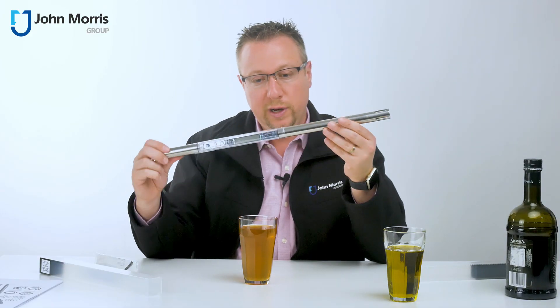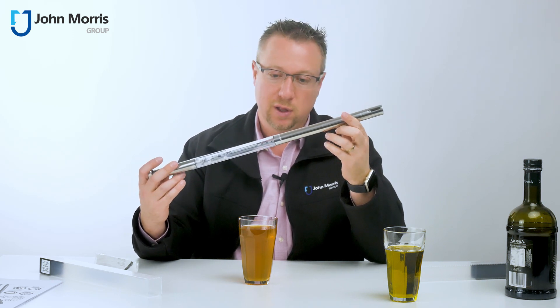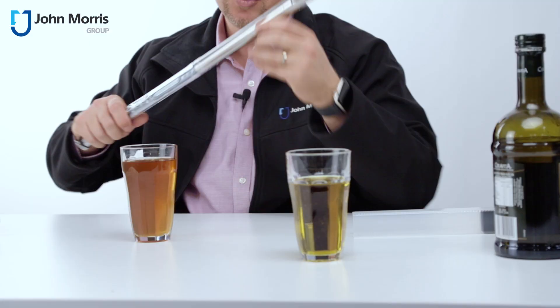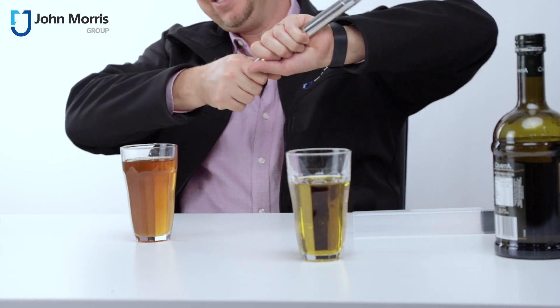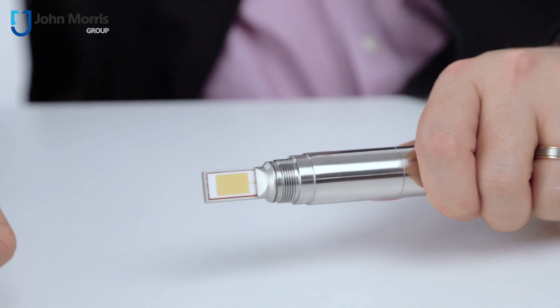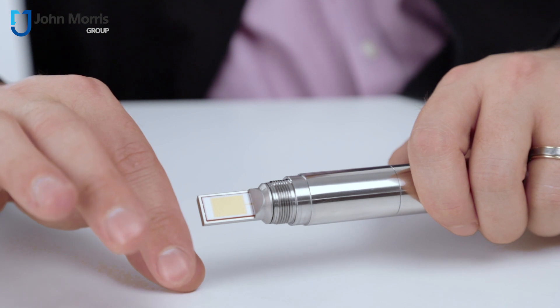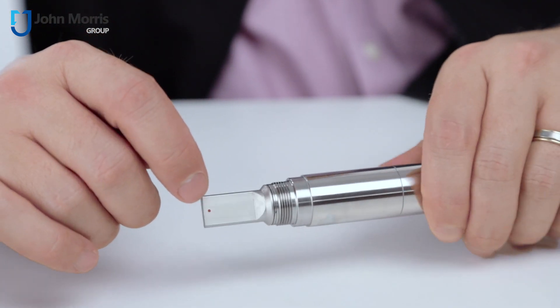The first thing I really like about this particular unit is its shockproof design. In a restaurant environment, we're not necessarily going to have users who are going to be gentle with the equipment, so you want something that's fairly robust and rugged. Most sensors, bluntly speaking, are not. You can see we've got the sensor itself hidden in between a nice solid stainless steel cover, and the actual sensor doesn't have any flimsy parts. It's got a nice flat surface and another detector on the other side.